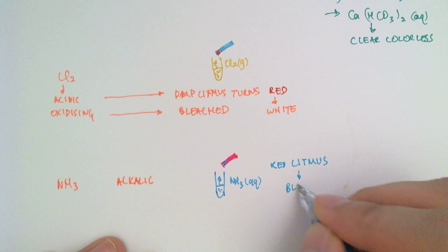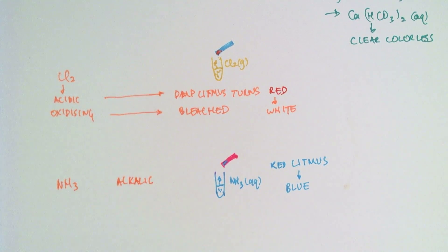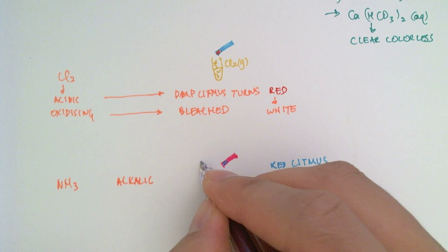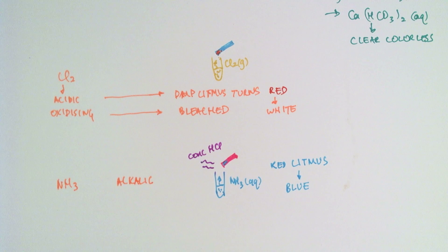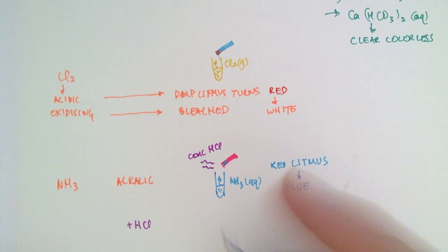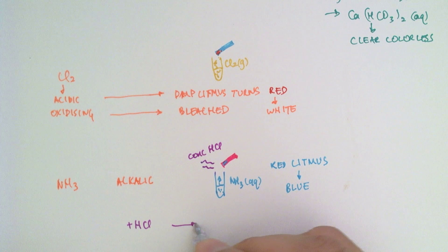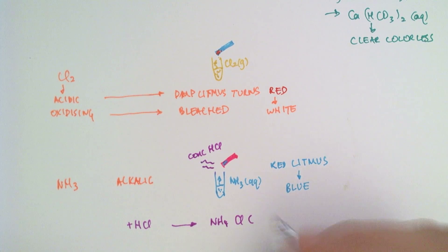So red litmus turns blue. Another test you can do is to release a little bit of concentrated hydrochloric acid fumes. And if you do that, you react with the hydrochloric acid to give you this white cloud of ammonium chloride crystals.